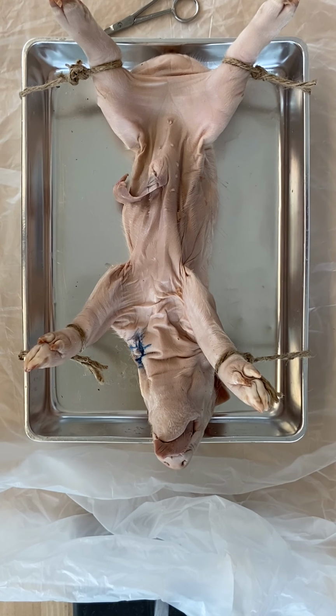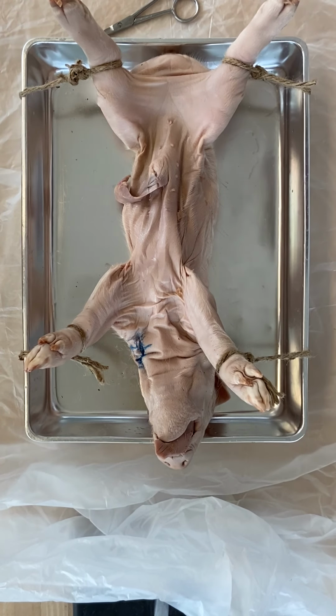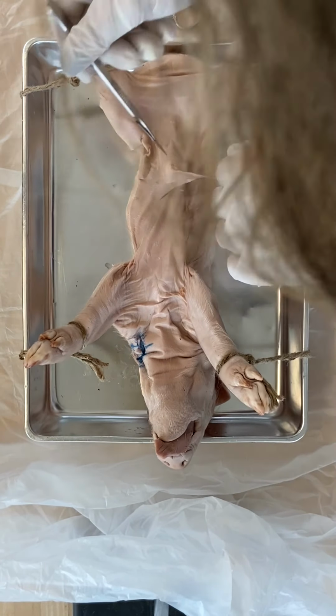So if we watch the fresh pig, this one is going to be a little different. He's a lot stiffer for a start. Okay, so little piggy. All right, should we do the same way we did yesterday? I think so. Okay, so we're going to start just in the lower abdomen.